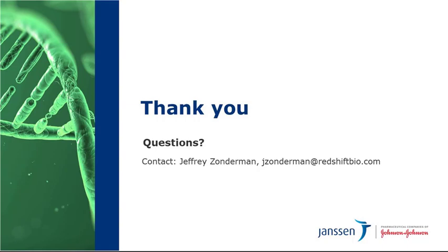So I guess that answer is stay tuned for future results. Exactly. And it's also in combination, as I mentioned, we have more results going on. My best estimation is that we've probably enough new data looking at this low pH hold and neutralization step to provide us anywhere from 4 to 8 months worth of work on the system when it comes to our lab.